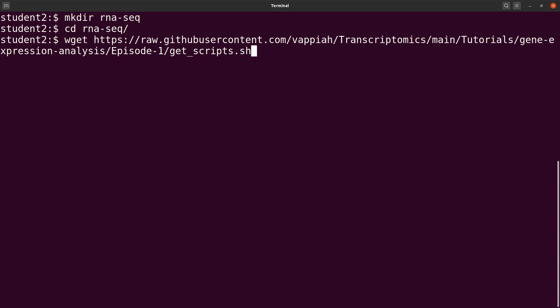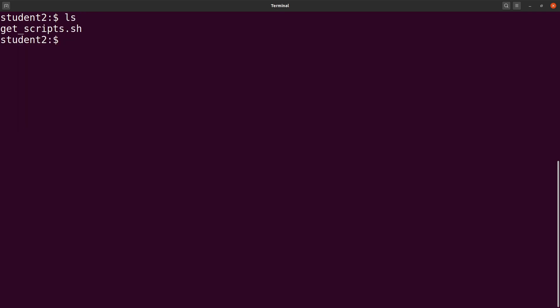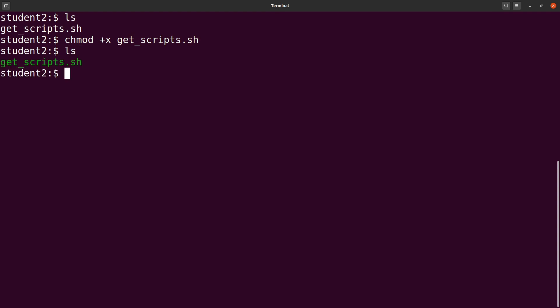Once we have this, we execute the command. The script has been downloaded for us. Let's clear the screen and check it out. Do an ls and you will find the file there. Because this is a bash script, we have to add execution rights. So we say chmod +x and we call the script here. Let's execute it — it's done.